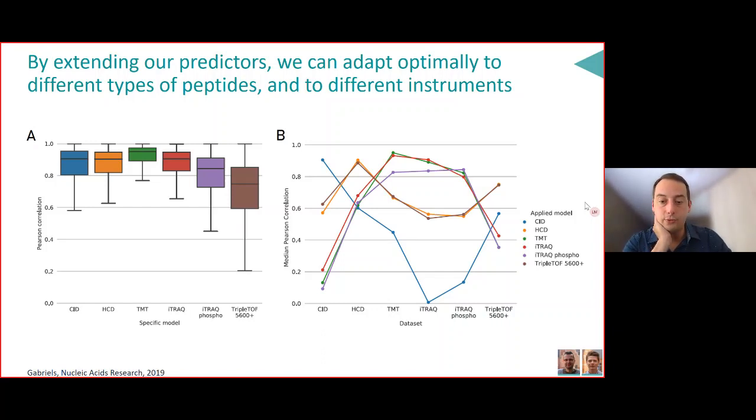Having said that, at the MS2 stage, still the fragmentation of that peptide is going to be affected by the presence of the label. So I again would hope that the TMT model will predict much more accurately and could offset the identification bias you might have, whereas then the MS3 level would give you a good quantification. But I don't really expect the fragmentation to be that dramatically different. Having said that, I haven't checked it in detail. But my expectation is that it would not matter at the MS2 level.